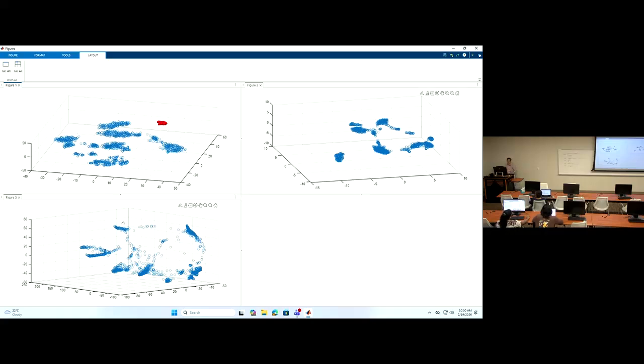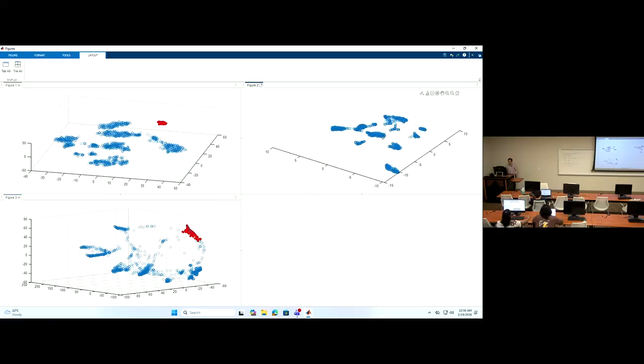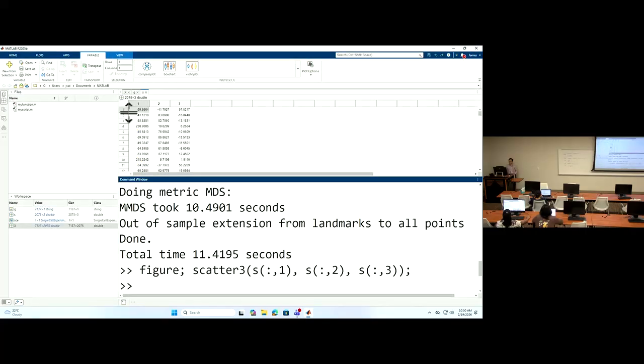But you don't have this function directly here because these three figures are not linked. You cannot highlight this part and say, okay, which the other part should be the same cells. So I don't know, maybe it's this, maybe it's this part. But in the toolbox, you should have that option.